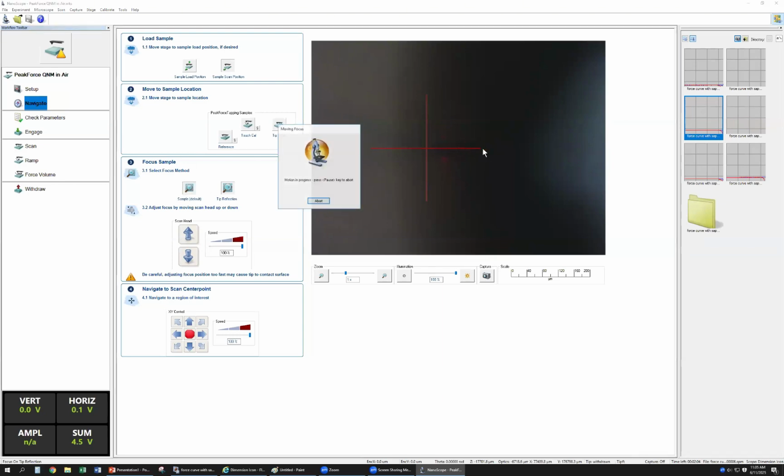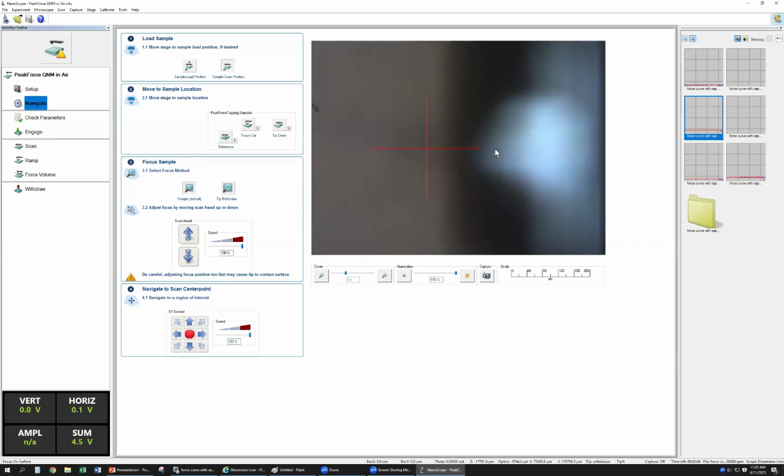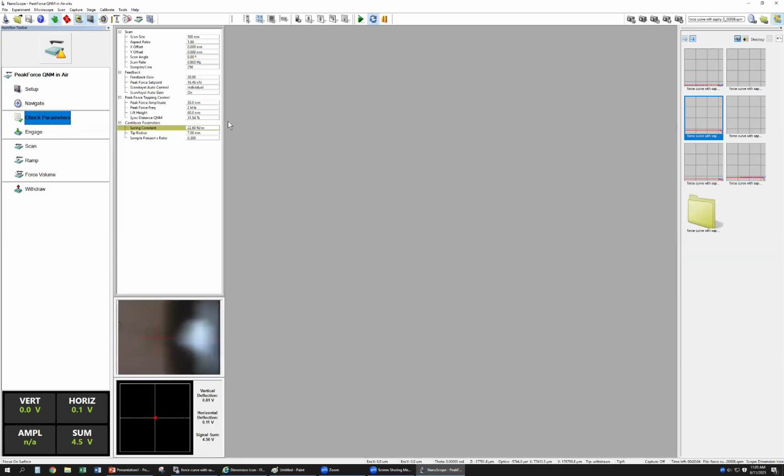Then you can see this probe. Then you can go back to the surface. So here is the surface. Okay, here is the surface. The relative method is engaged on the sample. You know the value, right? You know the modulus value. Then you can take this parameter.